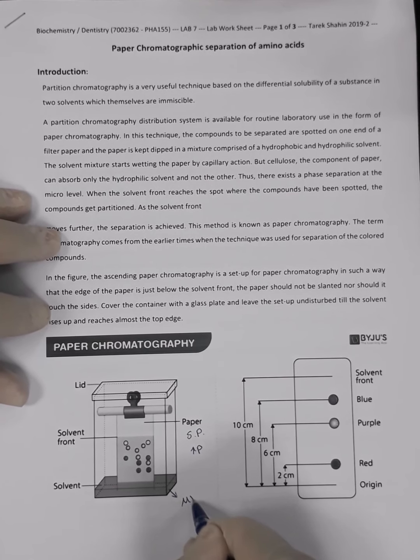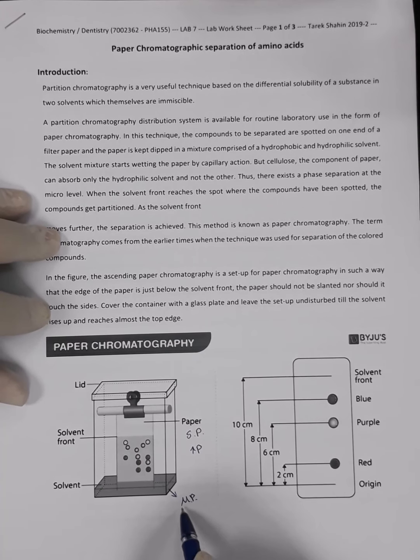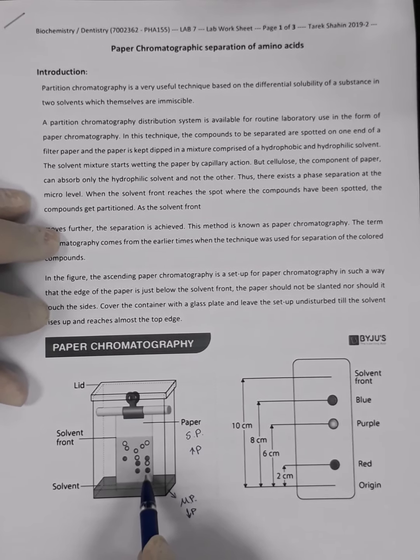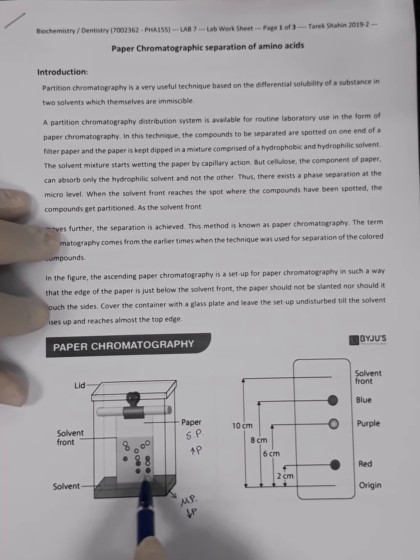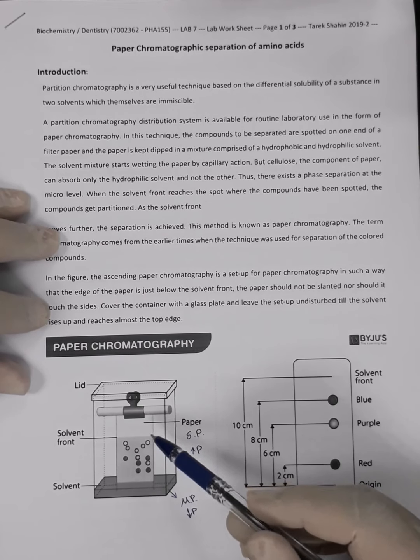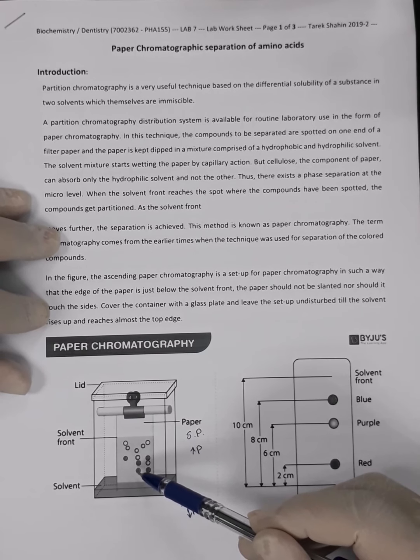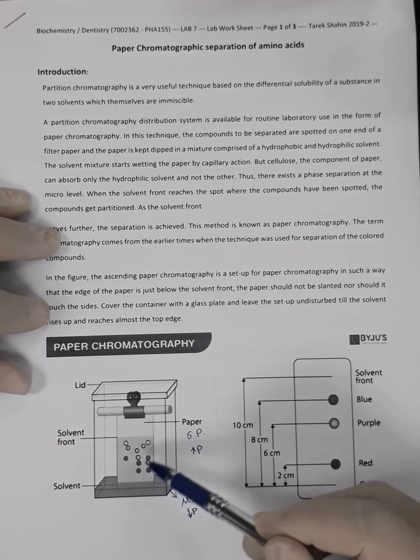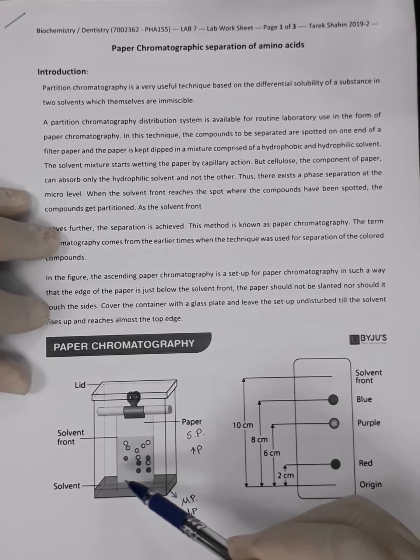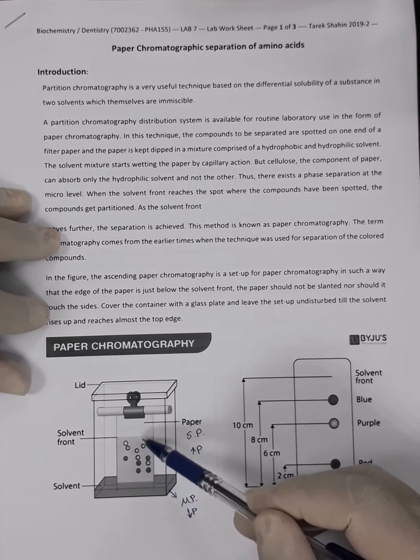While the mobile phase is present in the bottom part of the jar, and it can move up over the paper. That's why we call it the mobile phase, and it has low polarity. So whatever spots we put on the basal line of the chromatographic paper are going to move up, but this movement will be judged by the polarity of the chemical compounds. If the polarity of the compound is high, it will adhere more to the paper, so it will not move for a longer distance. While if the spots have low polarity, they are going to be dissolved by the mobile phase, and will move a higher distance.